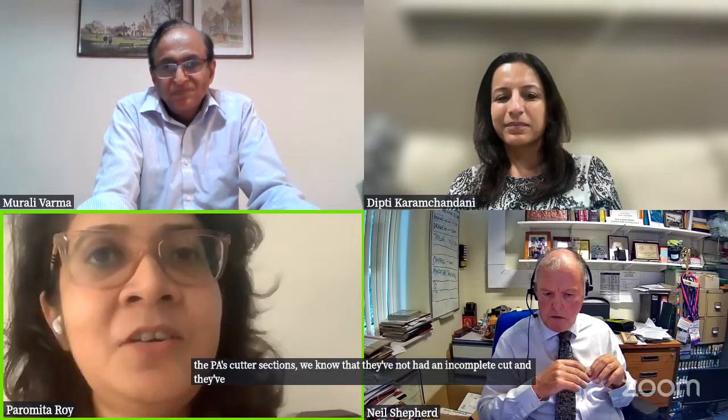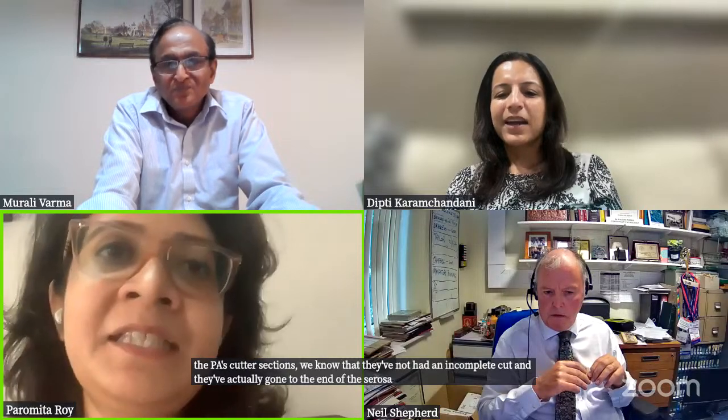I guess, no? I have other reasons why you shouldn't paint a serosal surface. If you have your T2 sections, you would know. If you have your tissue block. I like painting the serosa because when the PAs cut the sections, we know that they've not had an incomplete cut and they've actually gone to the end of the serosa. If I can see the ink. So one of the common problems we have is they cut. You see the microtomy. Serosal surface. You see the peritoneum. Cells. Yeah.